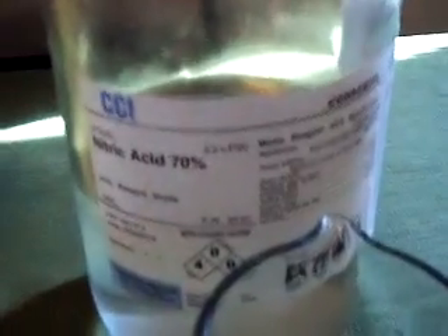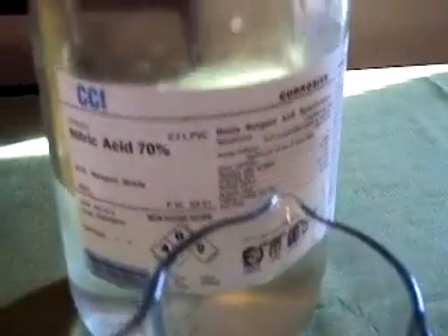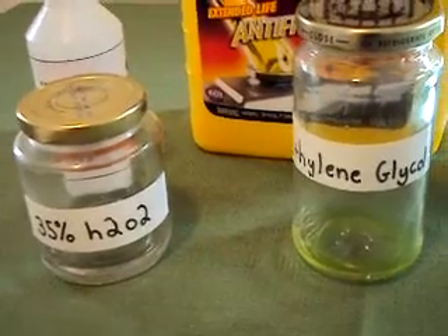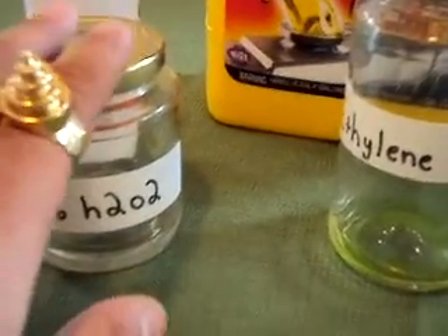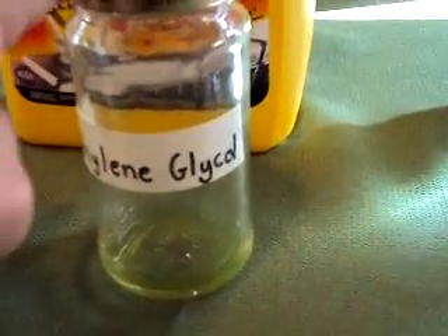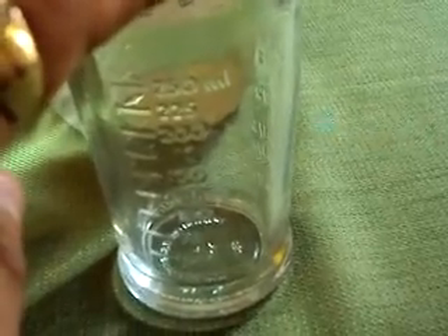And then we just have your standard 70% nitric acid in a measuring cup. I'll put that in when I go outside just so the fumes don't accumulate inside. The hydrogen peroxide is 49% of the total solution, the ethylene glycol is 22%, and the nitric acid will be 29%.